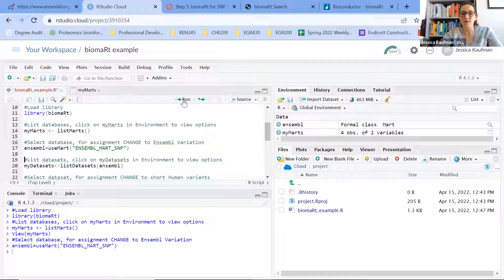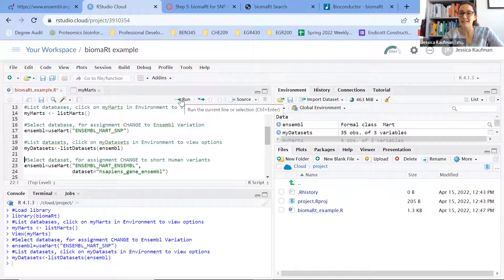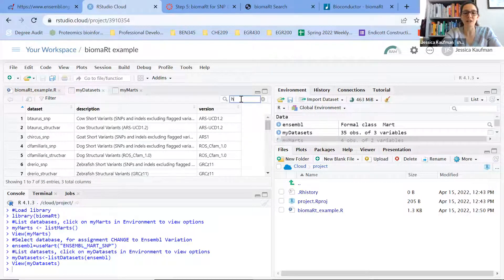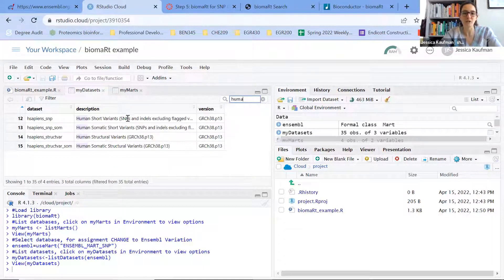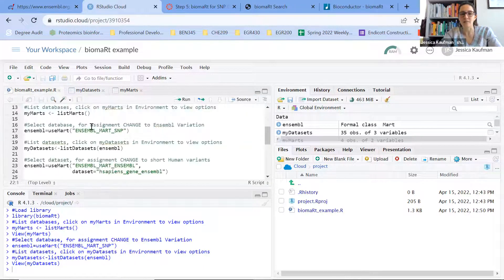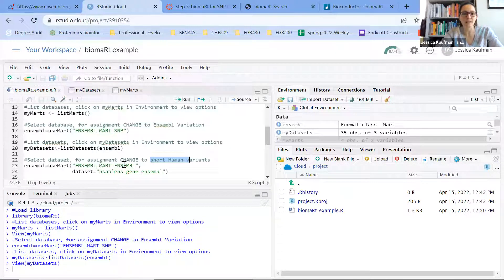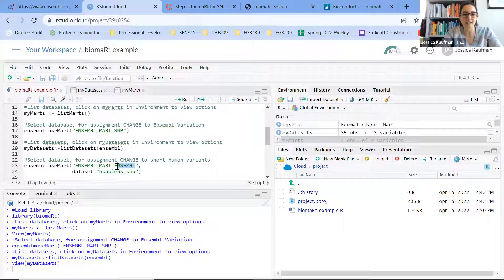Now that I've set my mart to be looking at variations, I can see what datasets are available. The datasets are different depending on which database you look at, and there are 35 choices. I can look through here — I'm interested in human, so I'll search for human. Specifically, the comment says to look for the short human variants, so the first result is the one I want. I need to make sure I change both the dataset and the database mart.